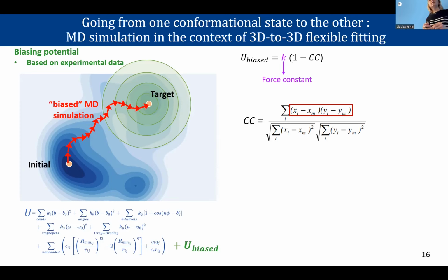But in this case, this is 3D flexible fitting. As I said, you imagine a 3D map, it is not noisy. But in our case in this field, I'm presenting you the idea based on 3D fitting, but we have images as target data, and if I put K very high, images are very noisy, so I can get the structure deformed or distorted due to noise.